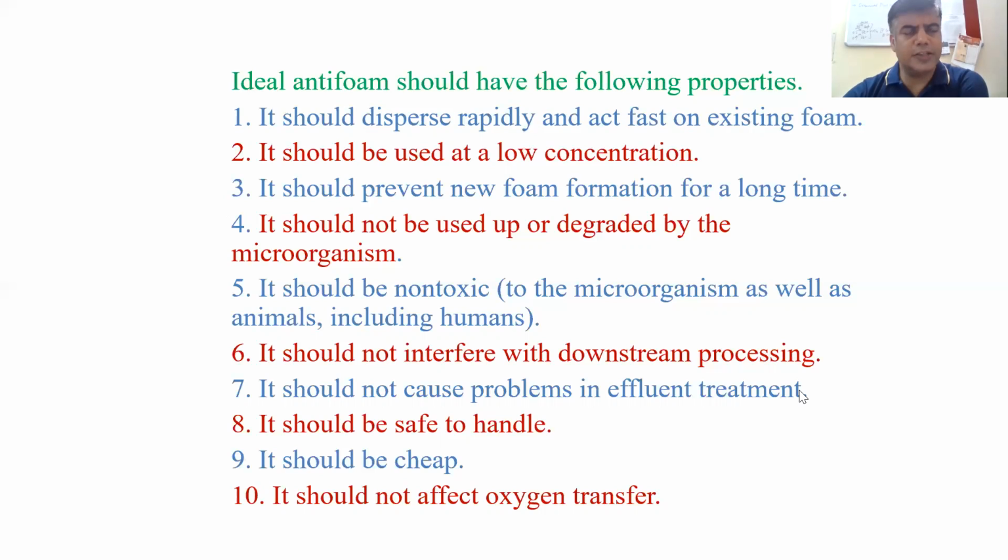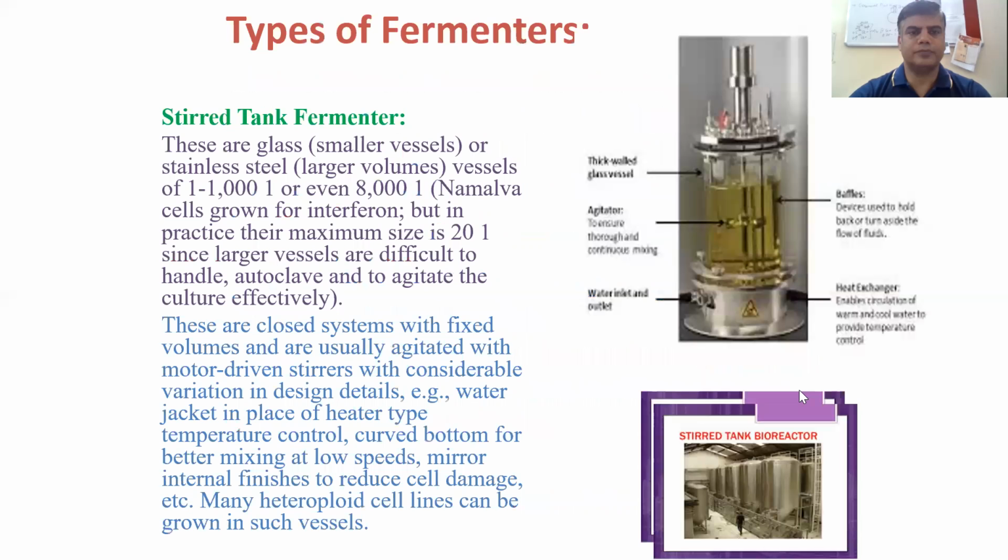It should not degrade the microbial activity or harm the microorganisms. It should be non-toxic. It should not interfere with the downstream process. There should be no problem in effluent treatment. It should be safe, cheap, and not affect oxygen transfer. So this is the ideal antifoam which can be used during the fermentation process.